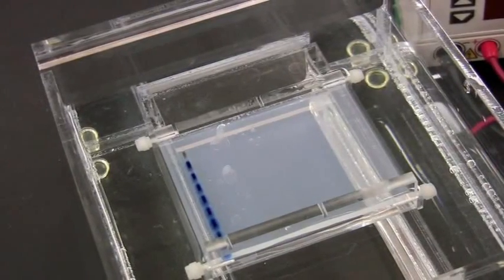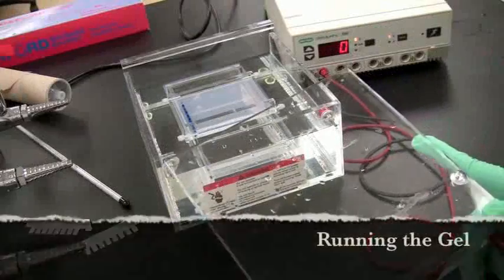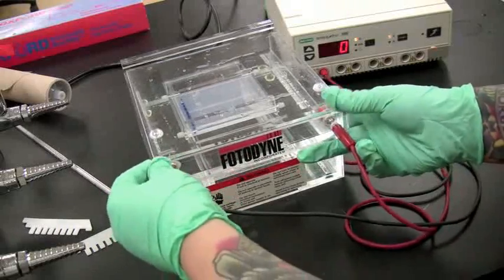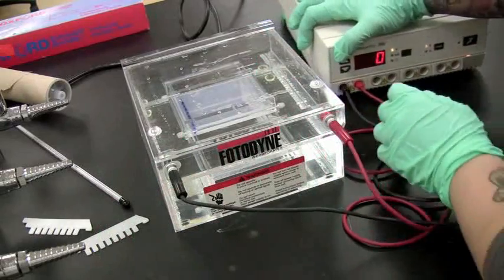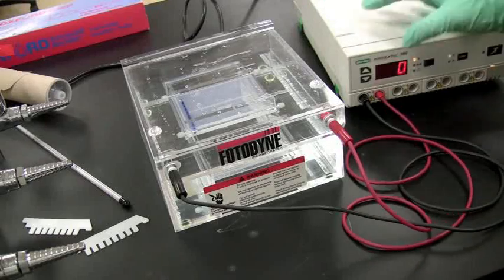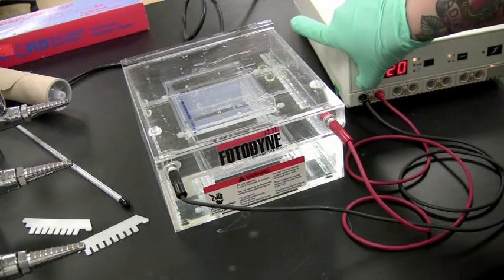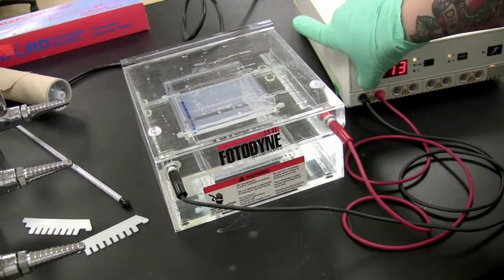This is what the gel looks like after the wells are filled. Now it is time to run the gel. Place the lid on the chamber, making sure all the black cords lead to the black jacks and the red cords to the red jacks. Turn on the power supply and run the gel for 30 minutes at 100 volts.